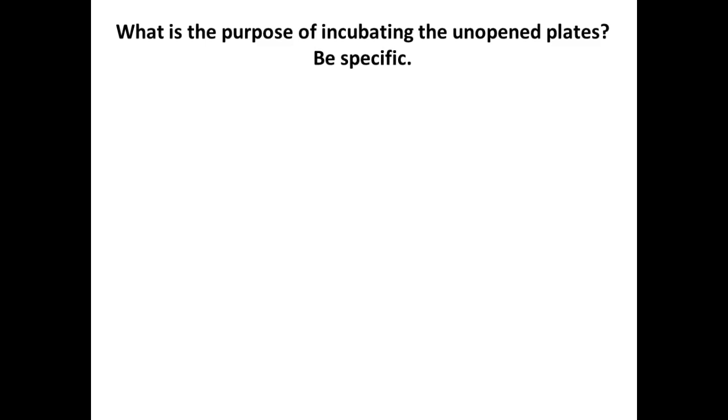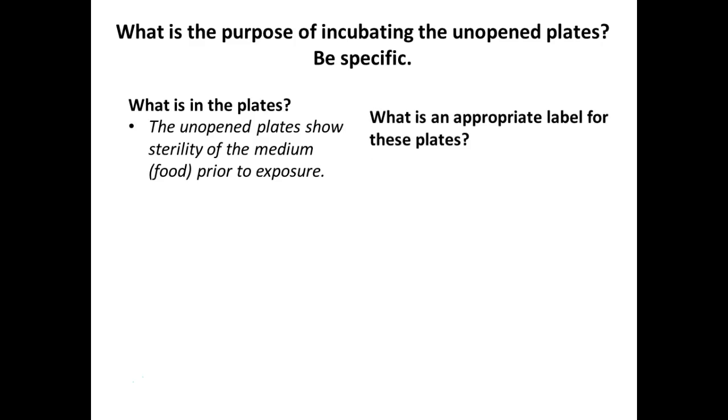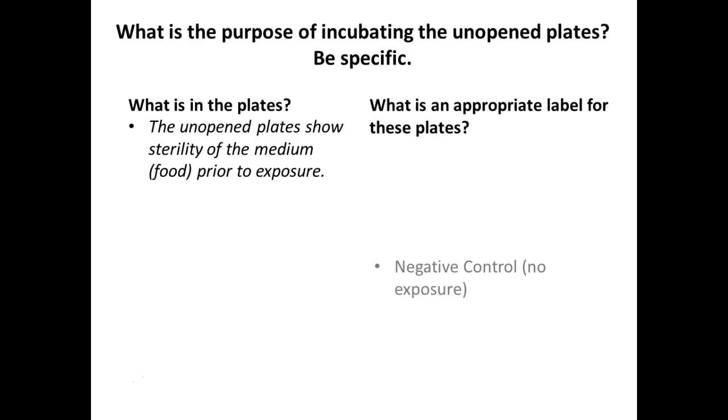So what was our specific purpose of incubating our unopened plates? These are our controls to show that the media is sterile to start. So remember, what's in these plates? If we don't open it, it's just the food, right? Just the media. That's it. So our label for these would be negative control or no exposure.